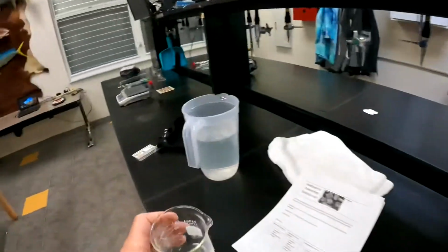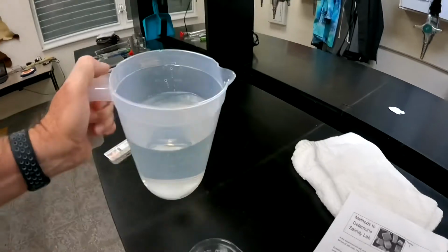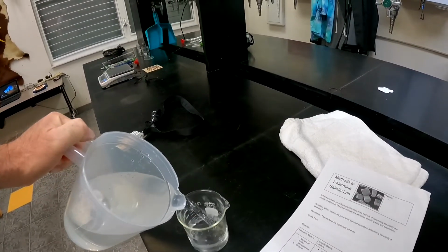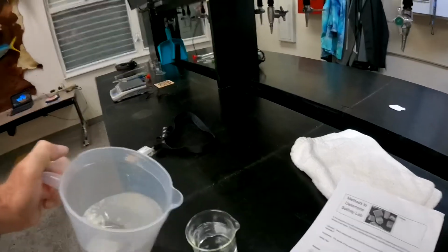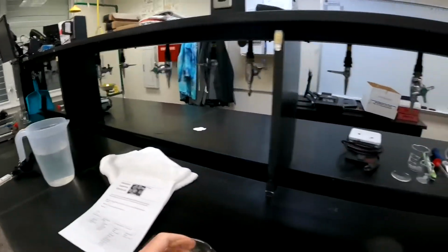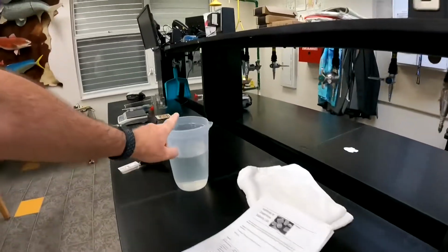The first method is called the evaporation method, and this method takes the longest, so we need to do that one first. The first thing we do is get a sample of salt water. At your lab station there should be a 250 milliliter beaker. Fill it up with the container. Make sure you write down the letter on the container.